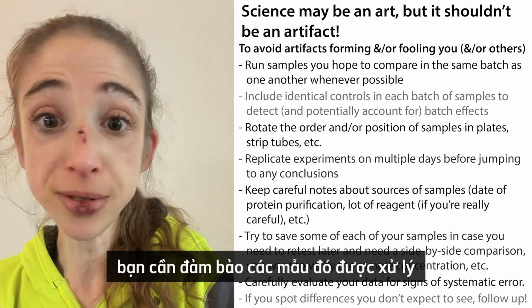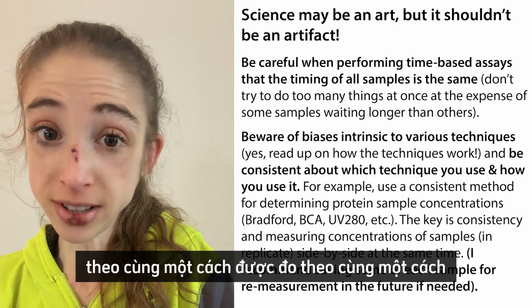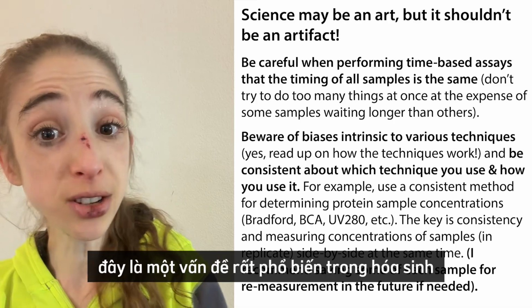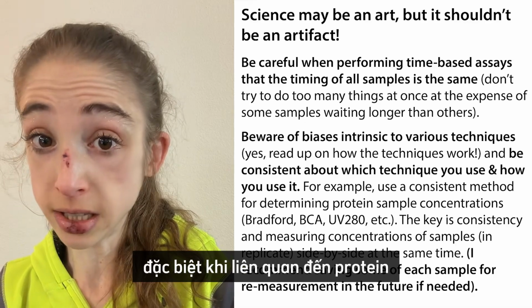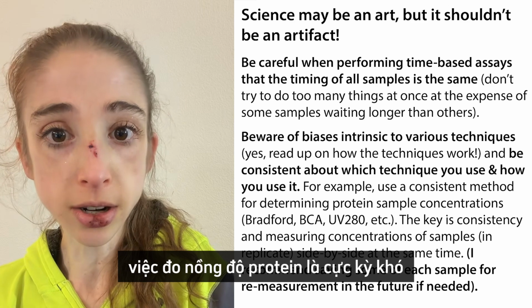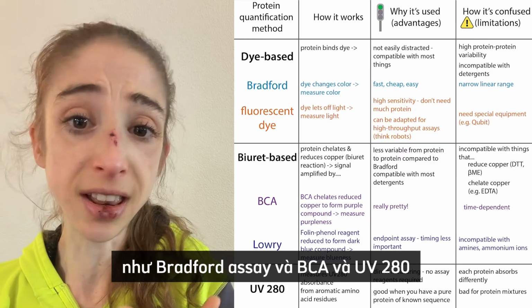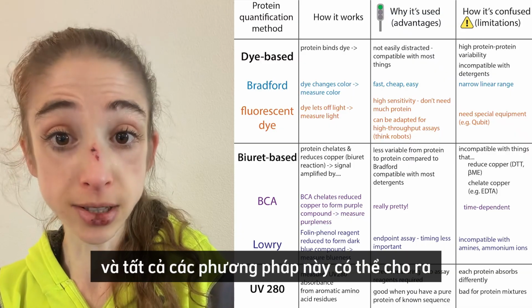You want to make sure that those samples are processed the same way, that they are measured the same way, that their concentrations are determined the same way. This is a really common problem in biochemistry, especially when it deals with proteins. Protein concentration is ridiculously hard to measure, and there are different methods like the Bradford assay, BCA, and UV280, and all of these methods can give you vastly different results.